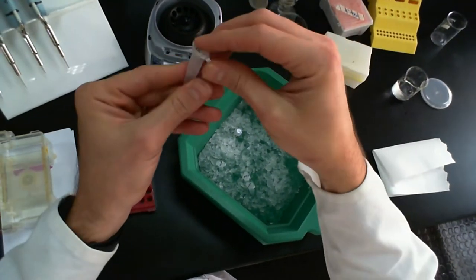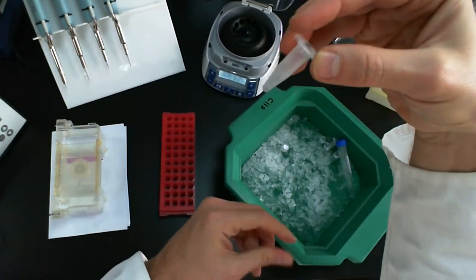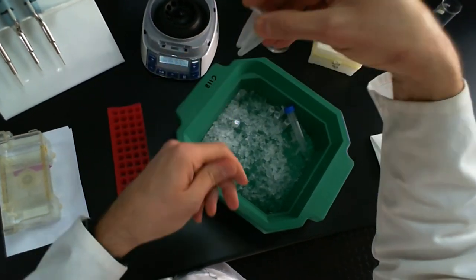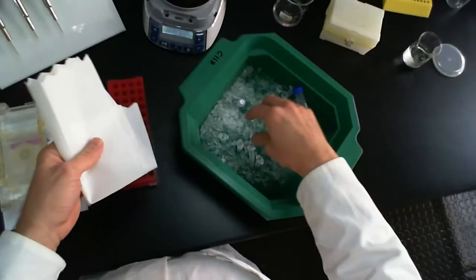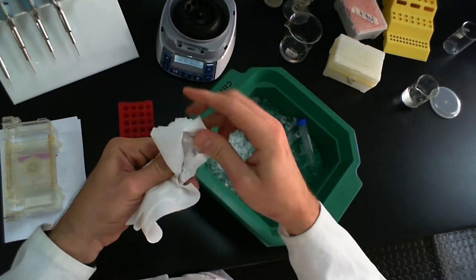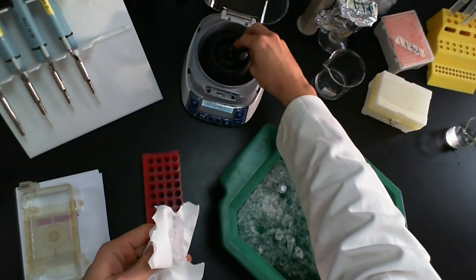And so you will notice that there is condensation on these tubes. Before we can do anything else, we want to make sure that we keep all the liquid at the bottom of the tube. So what we're going to do is spin these down in a centrifuge. I'm going to wipe these down, because I don't want to be putting extra water into these centrifuges. So I'm going to wipe down the outside and put them into the rotor.